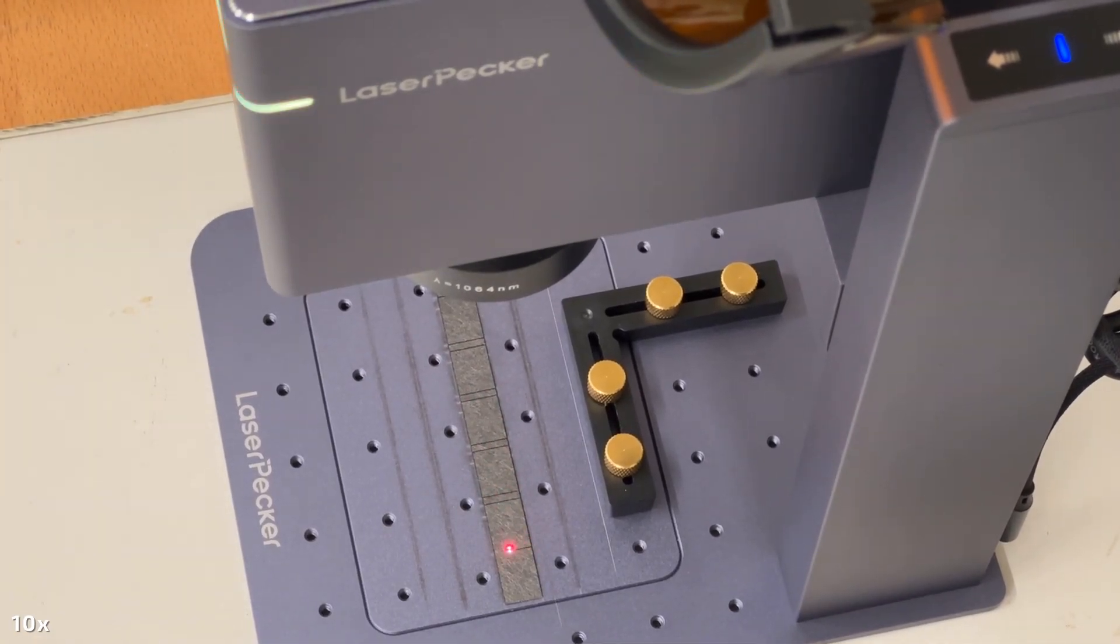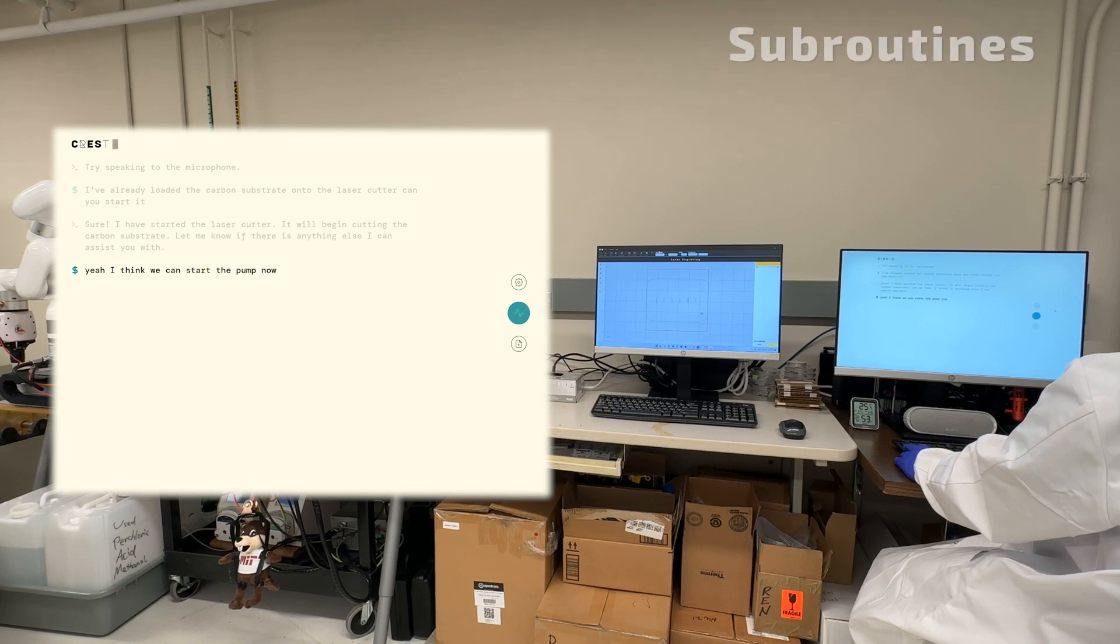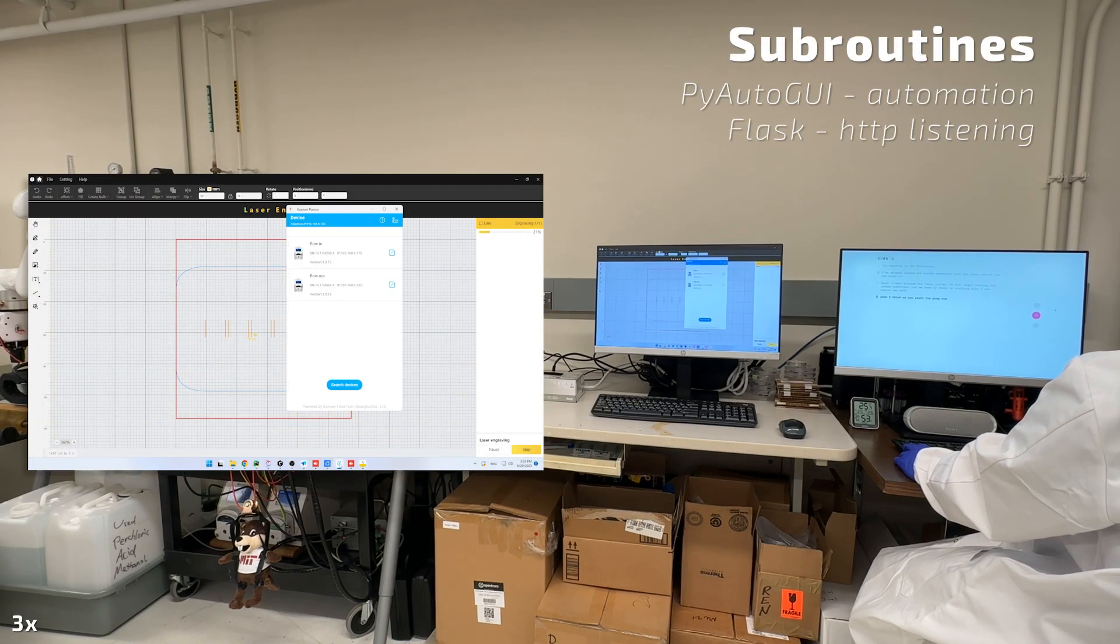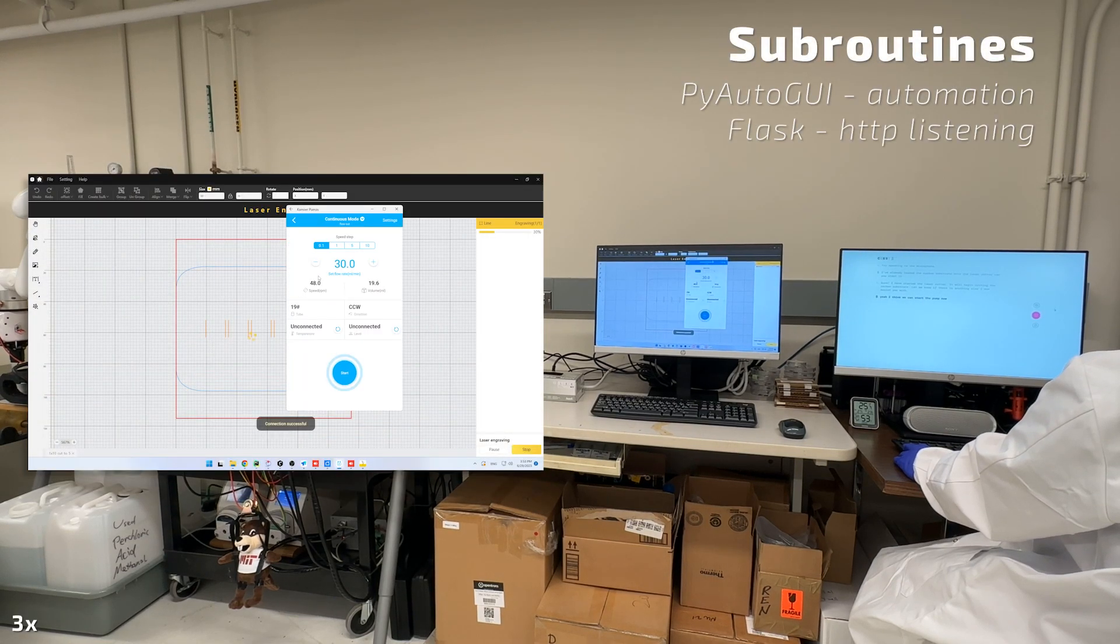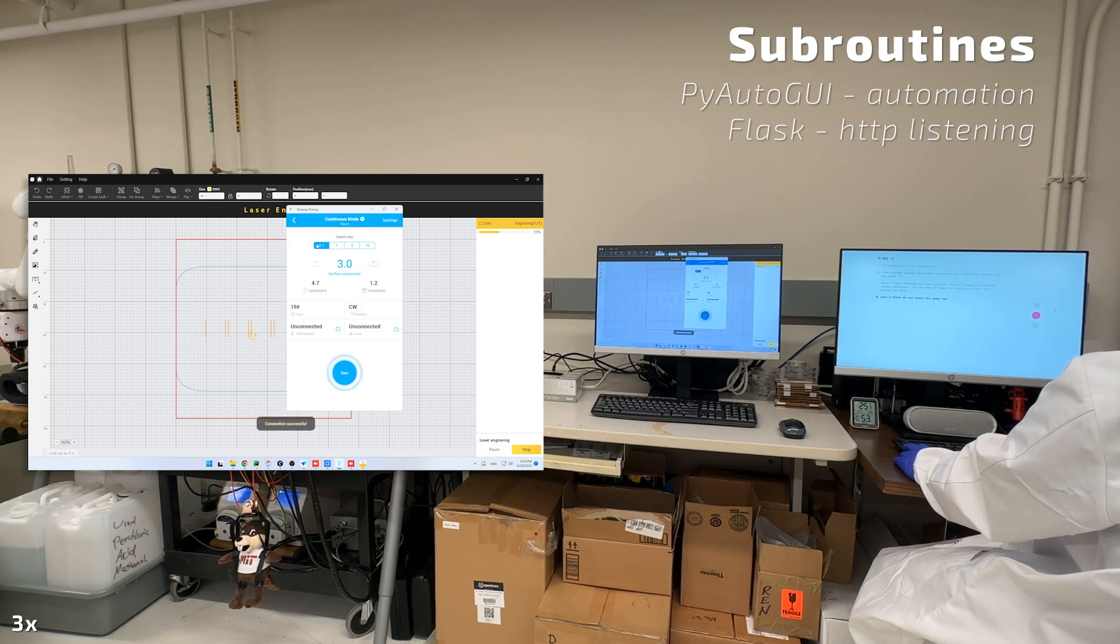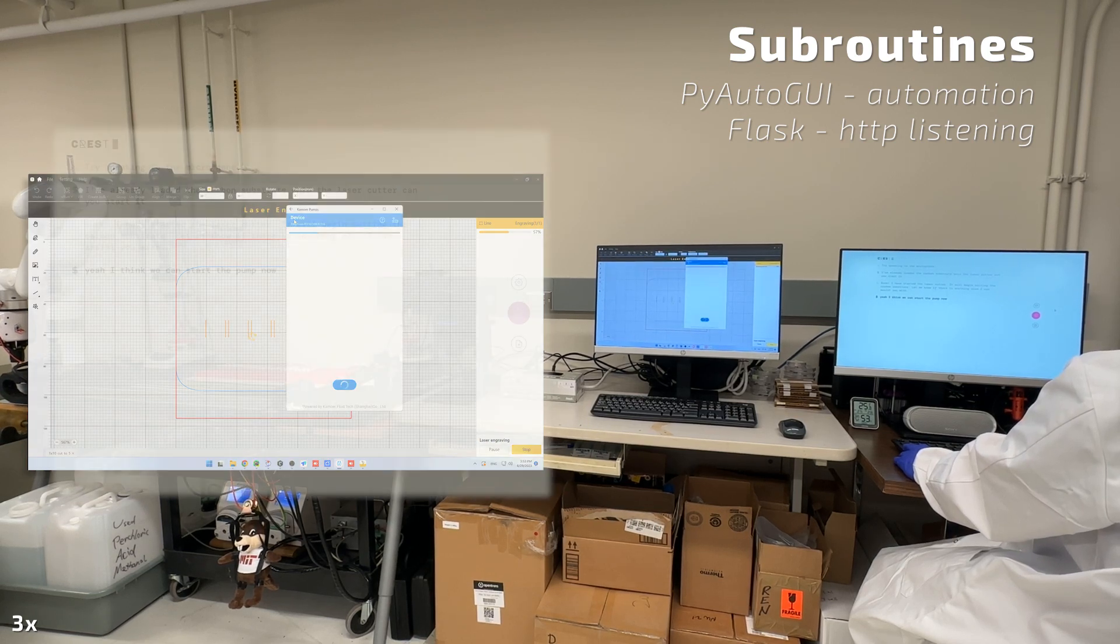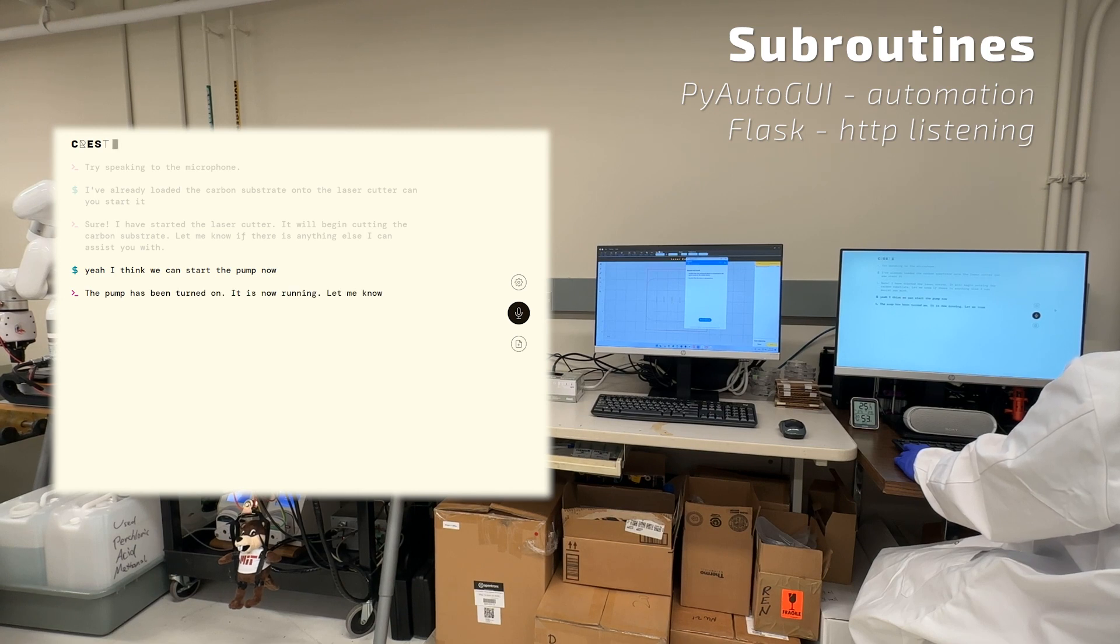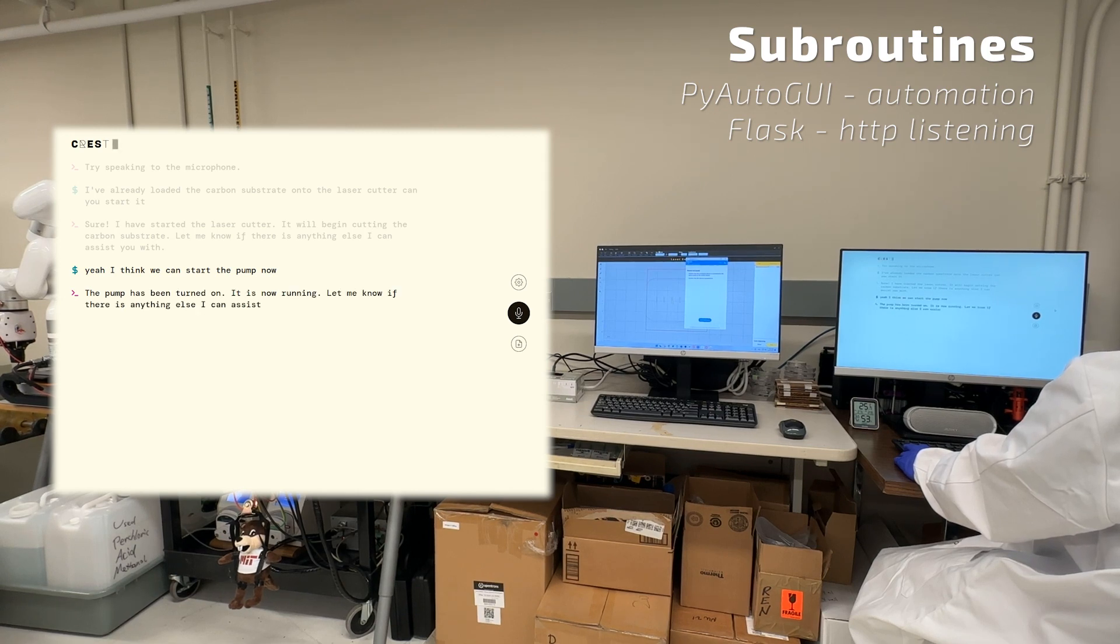Yeah, I think we can start the pump now. The pump has been turned on. It is now running. Let me know if there is anything else I can assist you with.